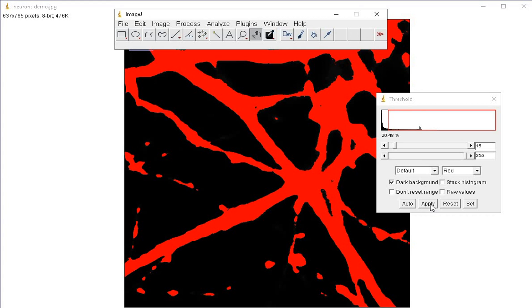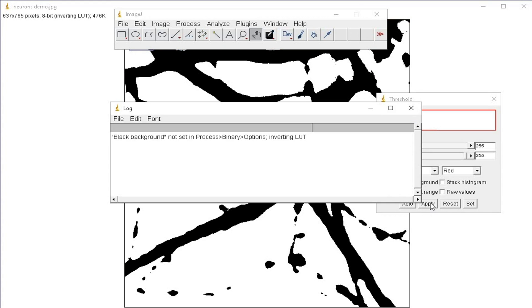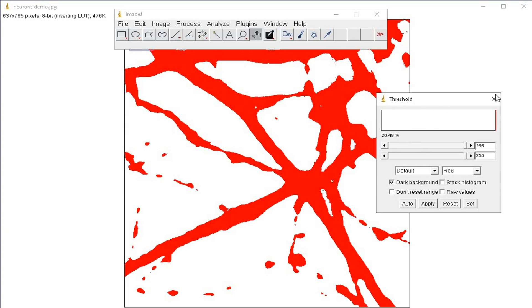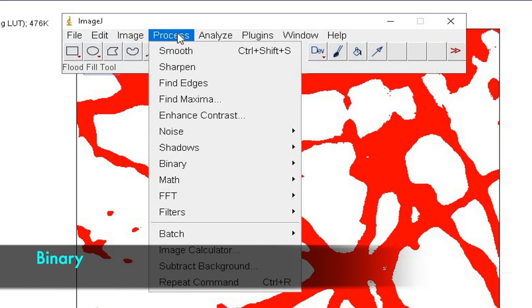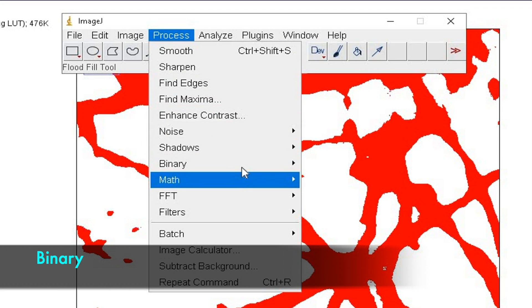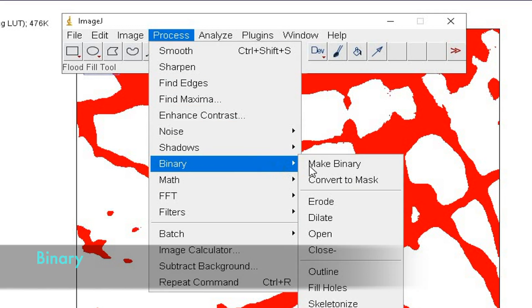Next, click on Apply and close the dialog box. Convert the image into binary by clicking Process, Binary, and Make Binary.